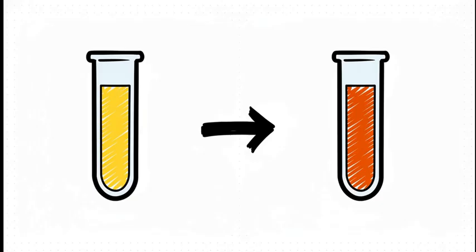But then, when we add the alkali in stage two, oh man, the color intensifies dramatically. It makes this huge shift from yellow to a deep, vibrant orange. That orange color, appearing right after the alkali is added, is our confirmatory positive result. Seeing that yellow to orange shift officially confirms, without a doubt, the presence of aromatic amino acids, tyrosine, tryptophan, or phenylalanine, right there in our sample.